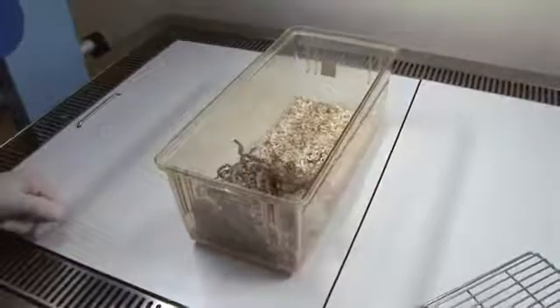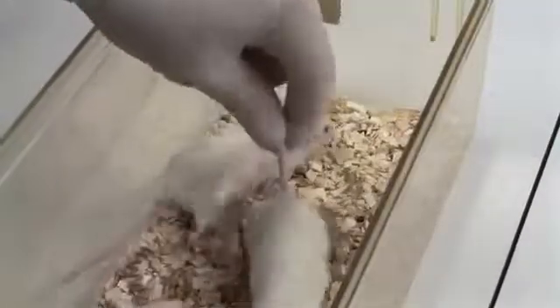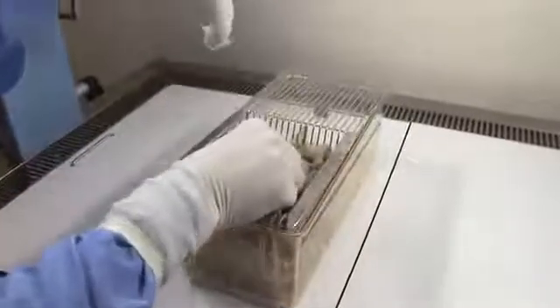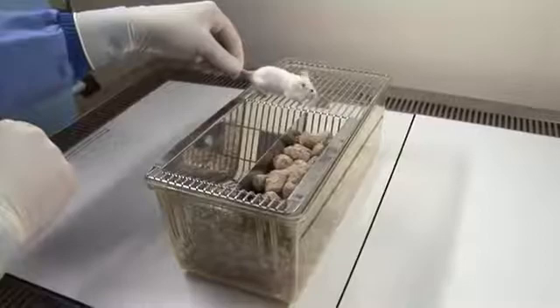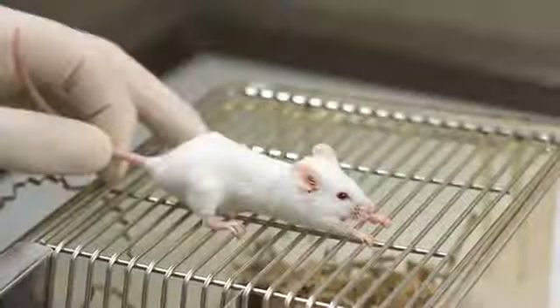The first mouse to be injected should then be restrained smoothly without hesitation, by grasping the base of its tail between your forefinger and thumb. The mouse should then be lifted from the floor of the cage onto your arm or onto the cage lid, while maintaining a firm grip on the base of its tail.